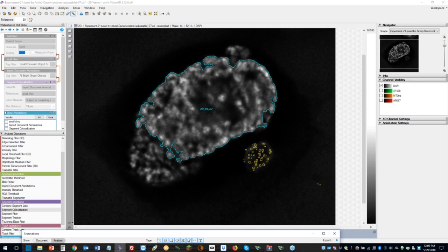Okay. I've got a question here from Oluwakimi, actually a problem where they've seen artifacts that have been mistaken for metastases in their samples. Is it possible that 4D imaging and analysis can help with that problem? Is it possible to separate artifacts from metastases?